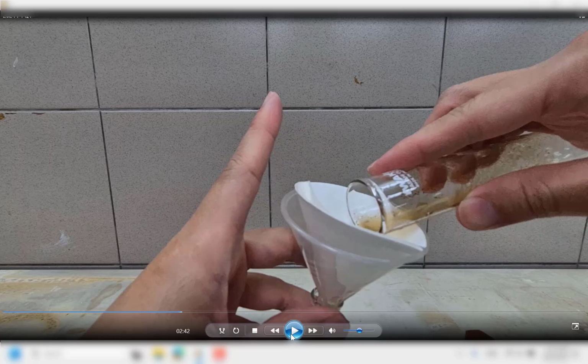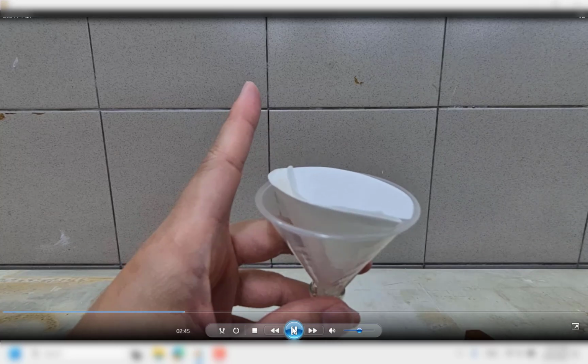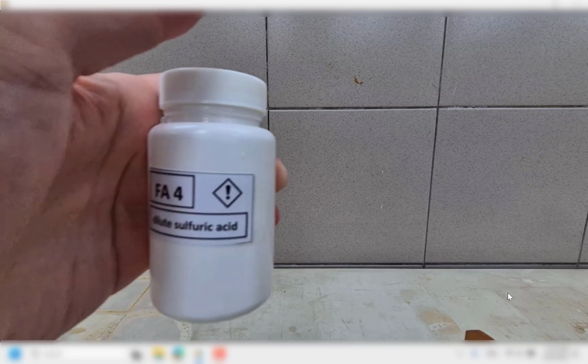Moving on to the next part, you're supposed to do filtering. That's on top of page 3. Remember that once you perform filtering, you need to highlight the color of the filtrate and the residue. So this is just a very quick way of filtering, and then after that, I just put it at the side. After a while, we'll come back to visit it and see what it is like.